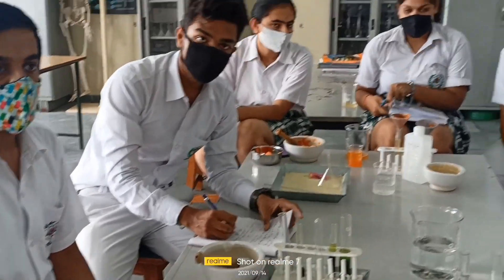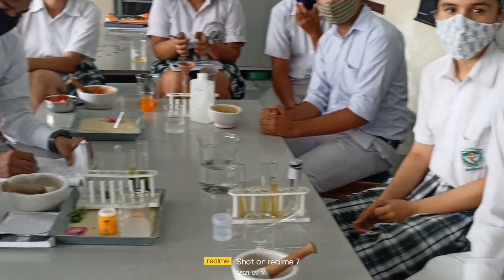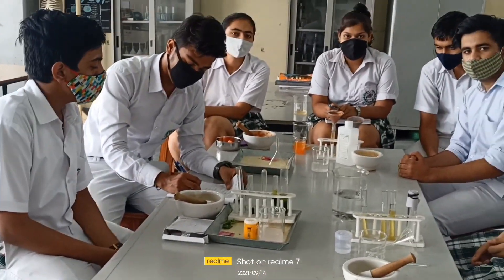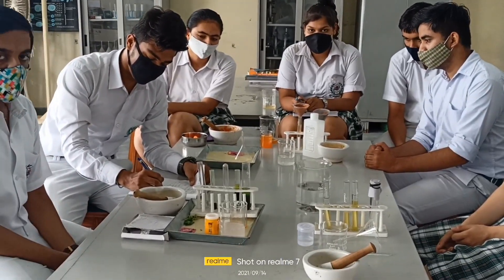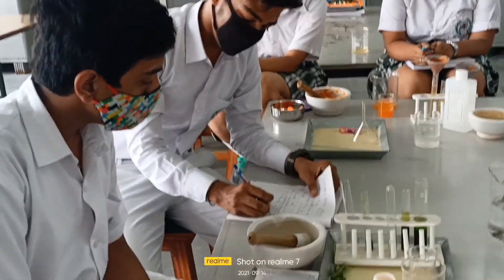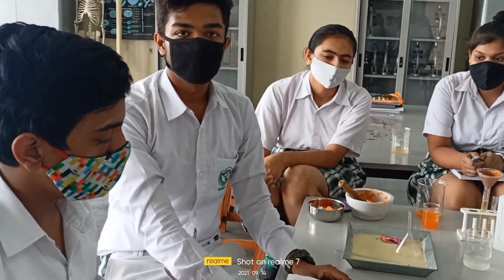Good morning students. These are our biology students of class 12th and they are doing DNA extraction today. They are using different plant materials for extracting their DNA. This is Team A.